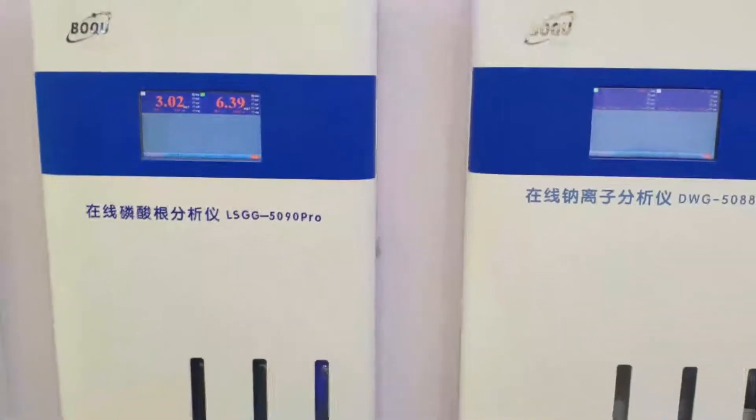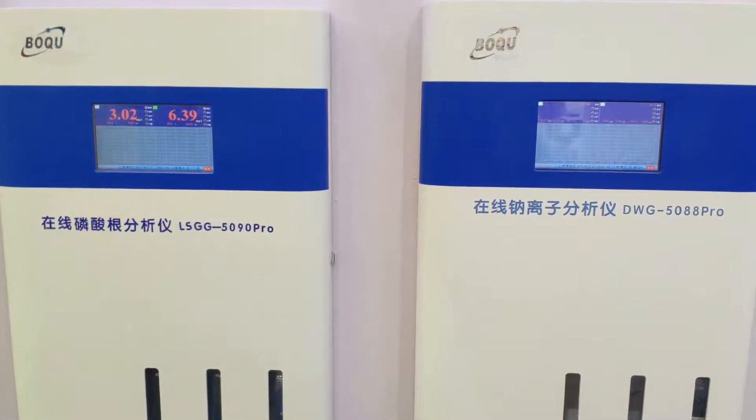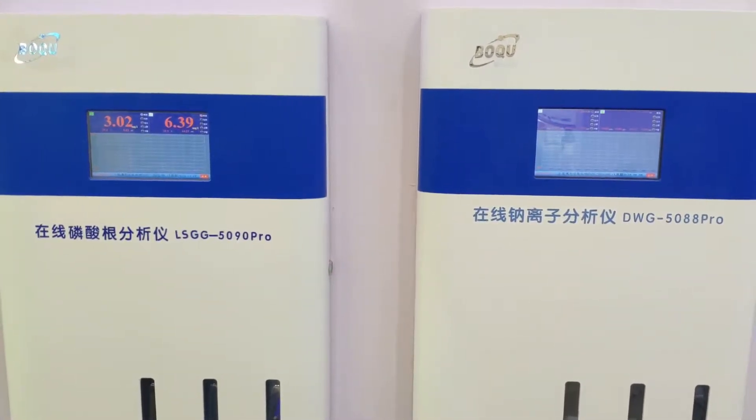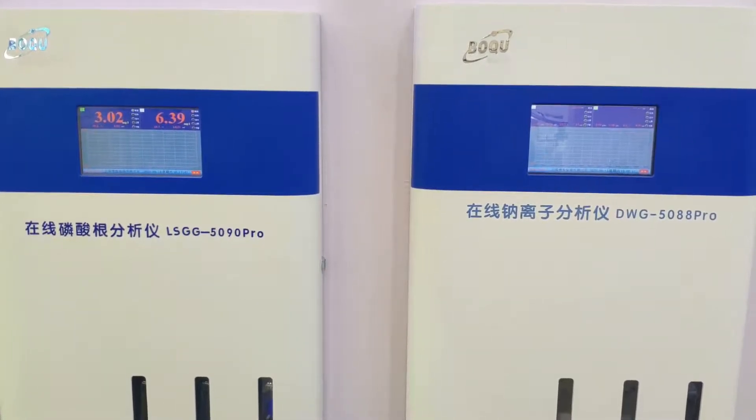Here is our lean bottle — a phosphorous, sodium, and silica analyzer, specially designed for use in power plants with the SWANS system.